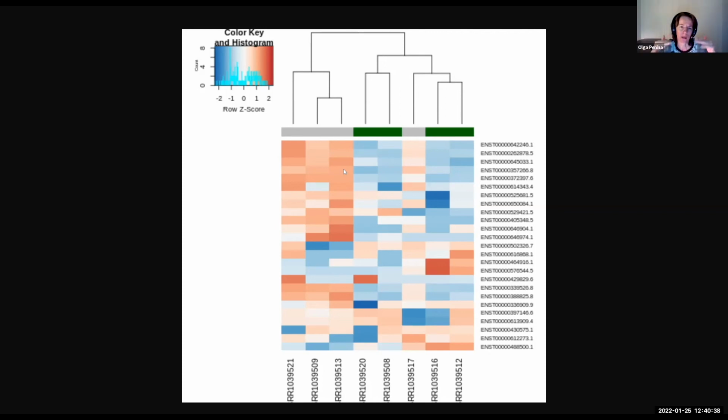And at the top we have these two clusters. Yes, I understand two clusters, but inside each cluster we have other subclusters. Yes. For controls we can still detect two subclusters, that have some difference between controls.